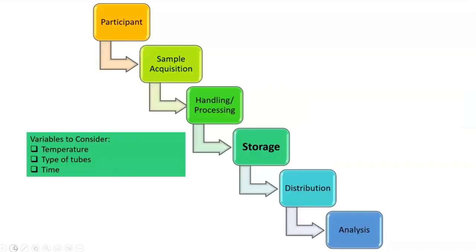You also need to think about how you're going to be storing your sample. Obviously, there are oftentimes specific requirements with regards to temperature. Do you need a minus 80-degree freezer, or is minus 20 okay? Can a sample just be refrigerated, or can it stay at room temperature, and for how long?